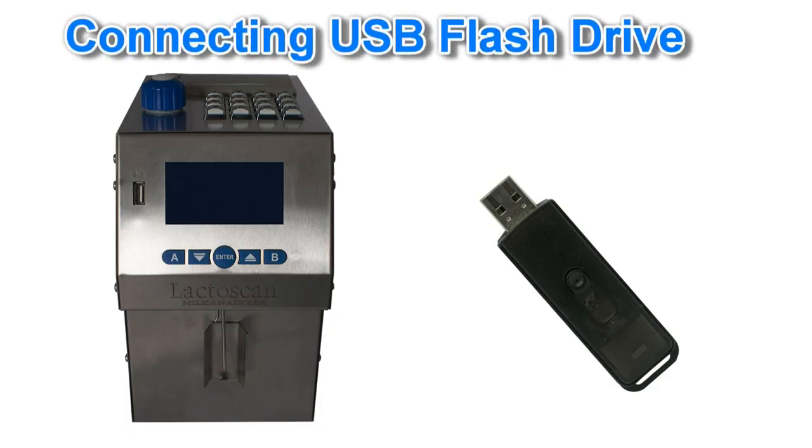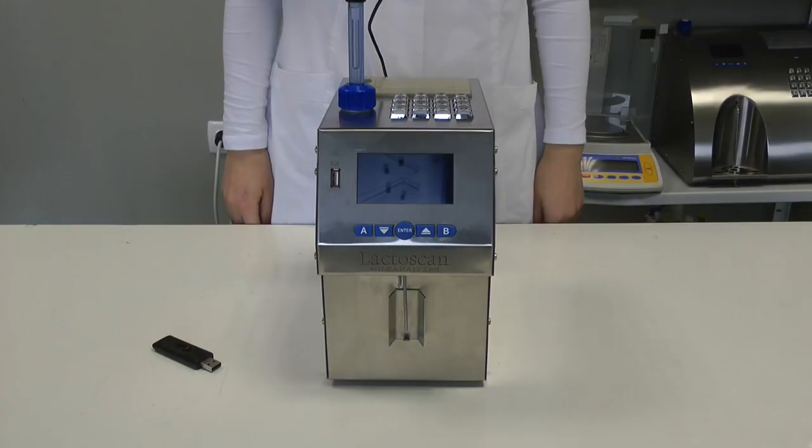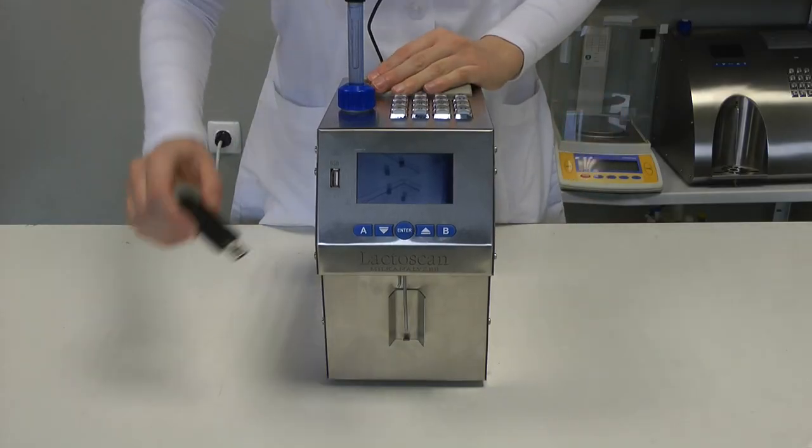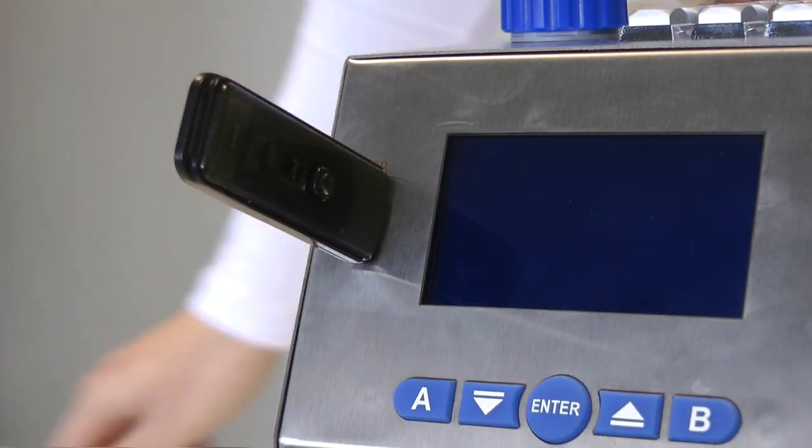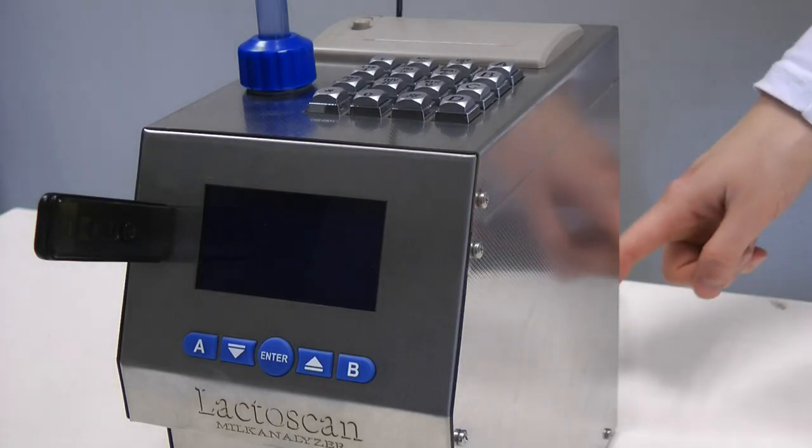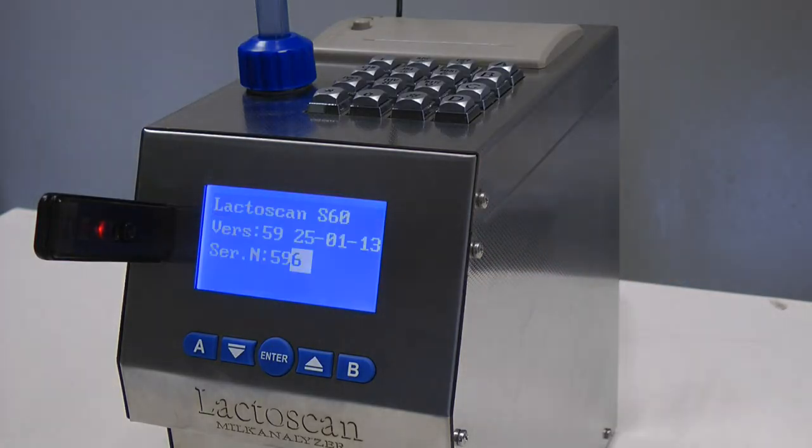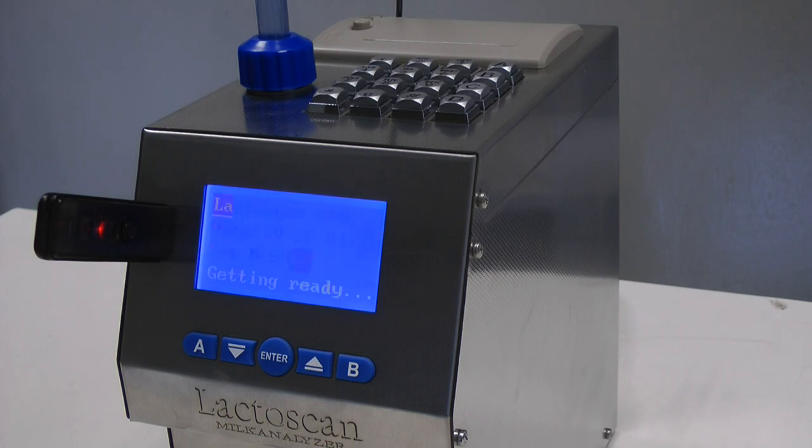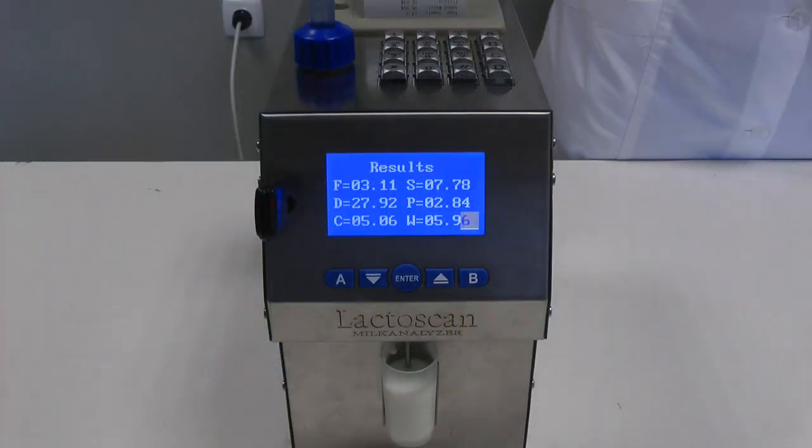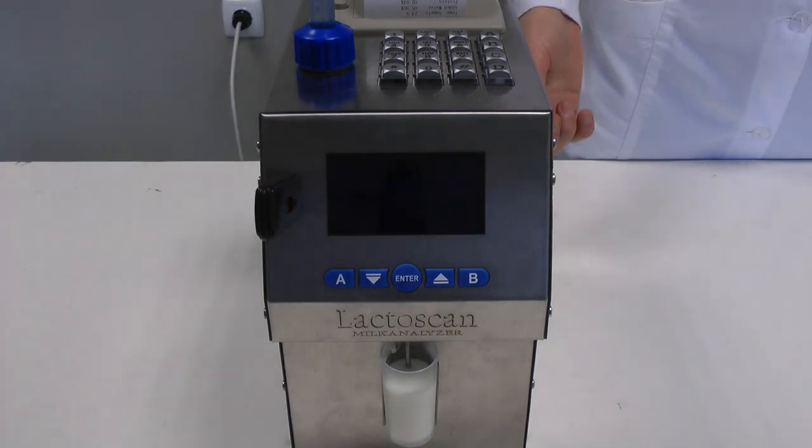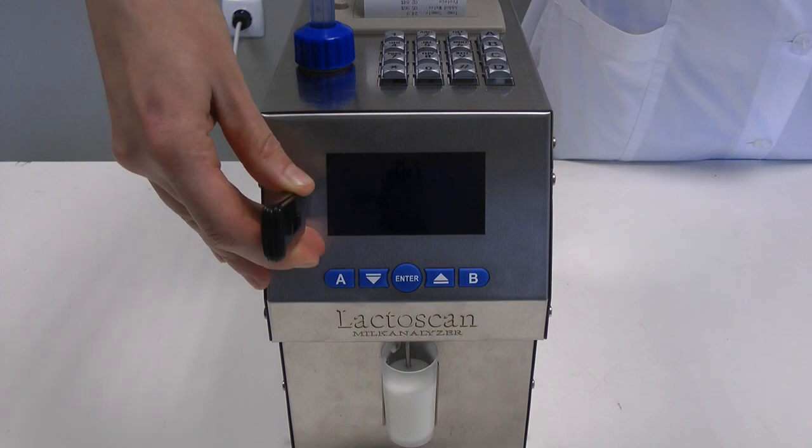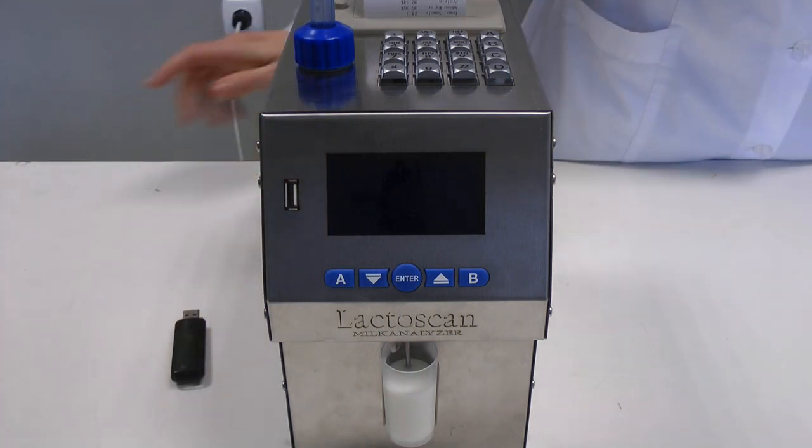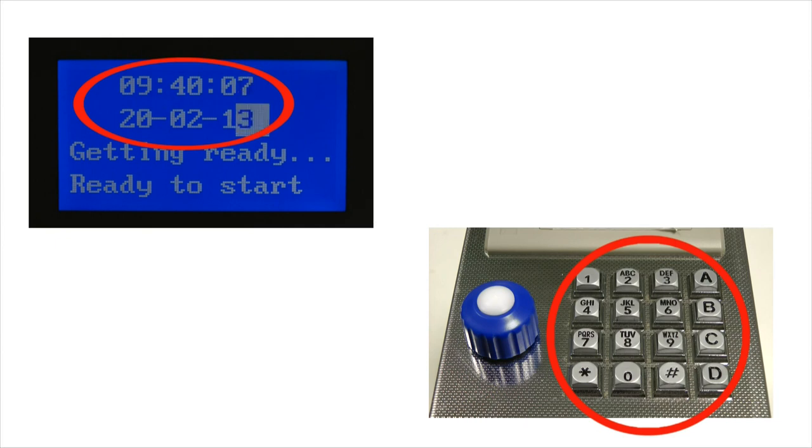USB flash drive. This option allows connecting standard USB flash drive to the LaktoScan. It automatically creates a log of all measurements made with the analyzer. After USB flash drive is connected, LaktoScan starts writing the results from each measurement. If you do not need to make an archive, simply disconnect the flash drive. We recommend this option to be used in combination with options for real-time clock and keypad.